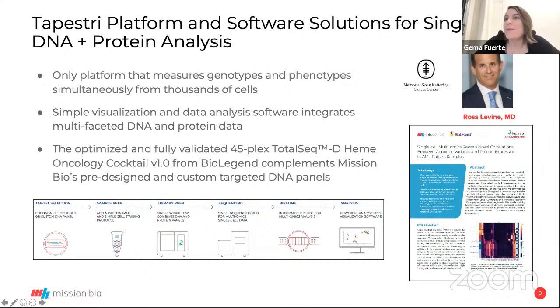Awesome, thank you, Kelly. Thanks, everyone. So as Kelly said, we are extremely lucky and very appreciative of the work we have done together with Dr. Ross Levine for the Multi-omics application note, which was the first application note we launched for this Multi-omics assay. So some data of this application note is what I will show today for the live demo of Tapestri Insights. Just to give you a little bit of background, this application note has two different experiments. One of them is to showcase the 45-plex TotalSeq-D cocktail from BioLegend plus PBMCs from patient samples. And the other one is the one I'll show you on the live demo.